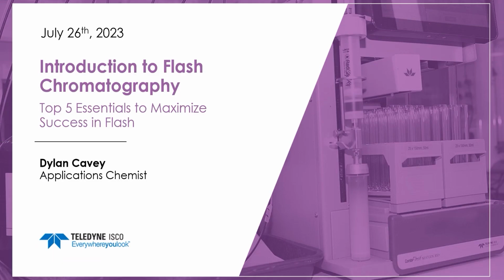Thanks, Josh. Thanks everyone for attending today's webinar. Today we're going to talk about an introduction to Flash chromatography, the top 5 essentials to maximize success in Flash. I'm Dylan Cavey. I'm an applications chemist here at Teledyne ISCO. Before we begin, I would like to point out that there is going to be a Q&A section at the end of today's webinar. So if a question comes to mind, don't be afraid to type that into the question box below, and I'll try to answer those questions as best as I can at the end of today's webinar.